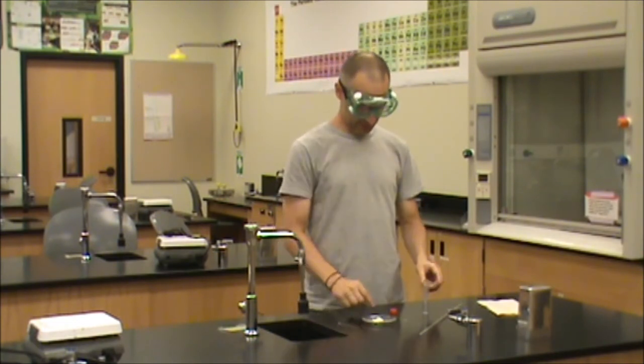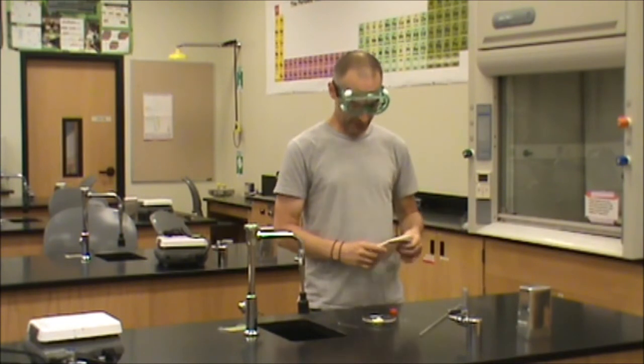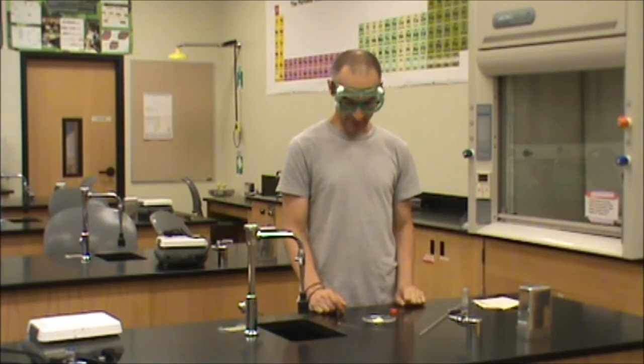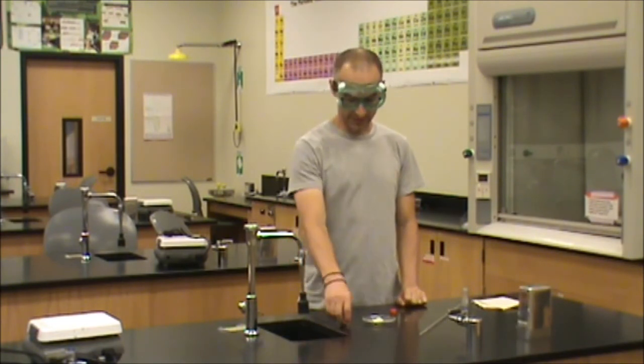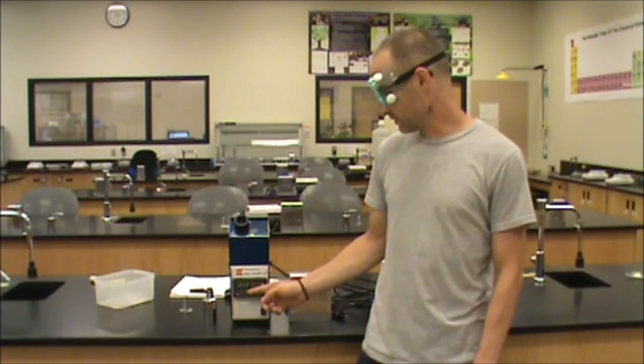One thing to know is that we often spill a little bit of sample on the counter. If you make any mess, I recommend using a damp paper towel to wipe up any sample that might have spilled. Our sample is now packed in the melting point tube and we are ready to measure it. We can see that on the front of the instrument the two temperatures match, indicating that we've reached our starting temperature and the instrument is ready to use.